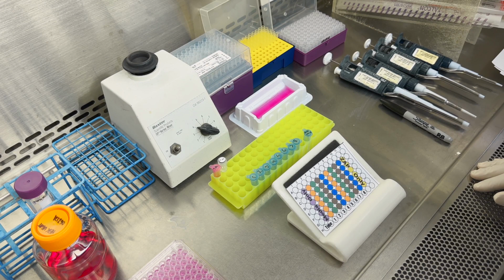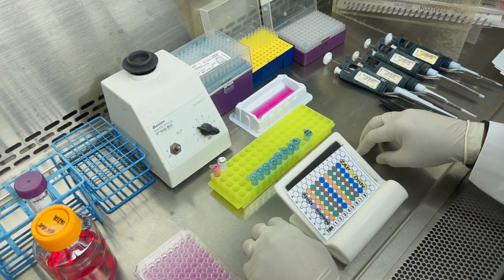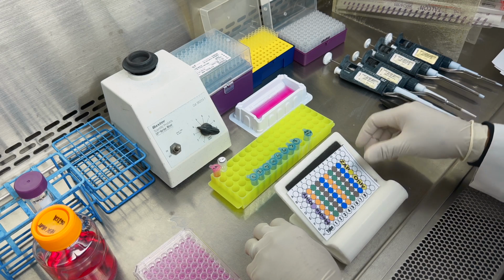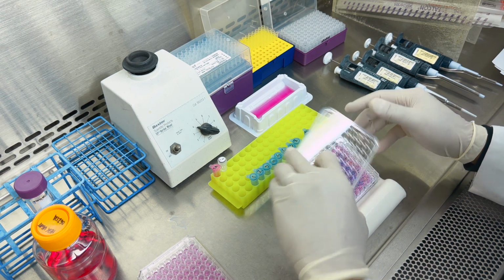Now it's time to add our material to the plates. What we need is our plates, and we need the well template that comes in the kit. We also need all our dilutions from the Excel spreadsheet and some more fresh cell media. First thing we will do is place the well template underneath the plate. Go ahead and remove the lid and set that to the side.